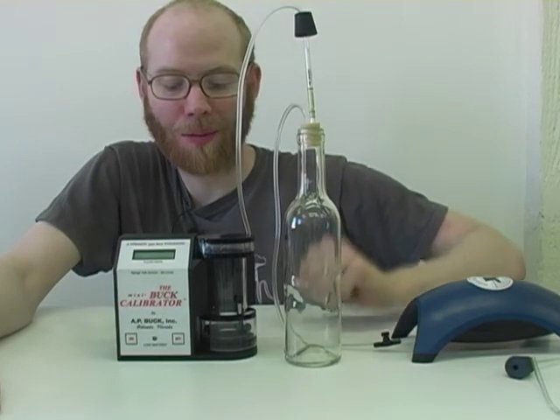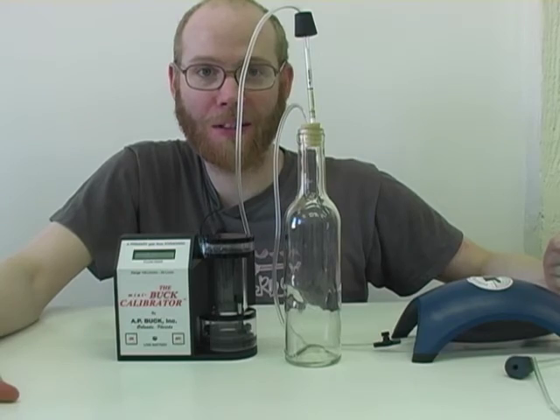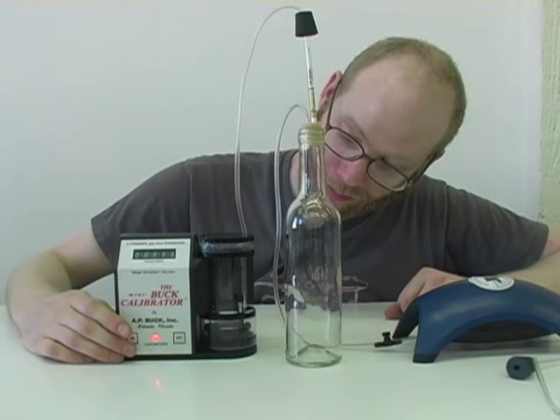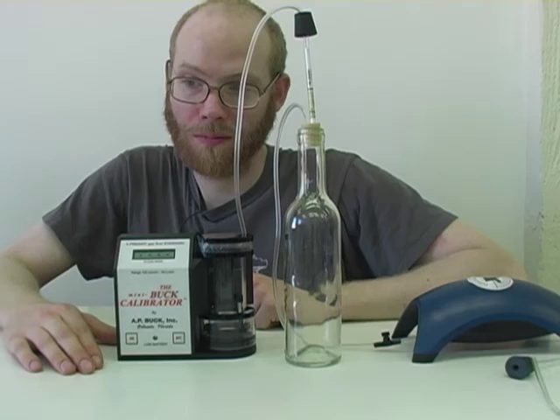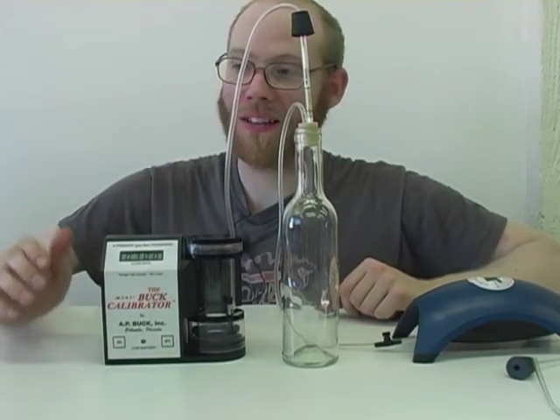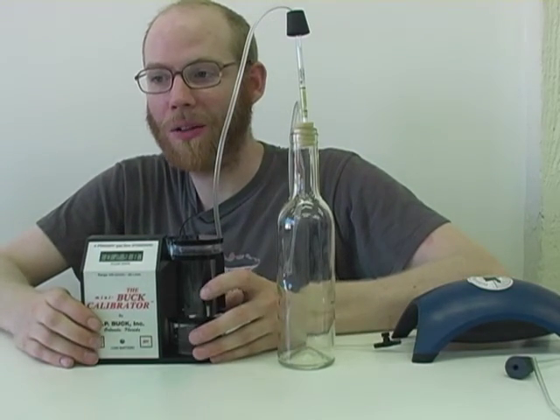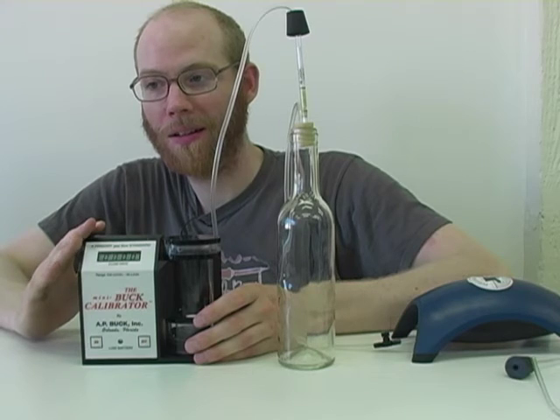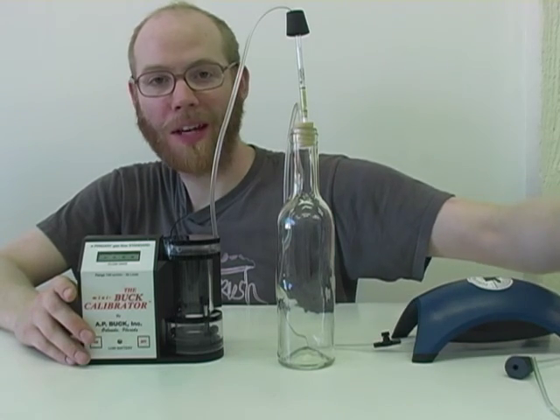I cleaned out the mini buck calibrator. I'll turn the pump on and take a measurement. The graduated cylinder measurement was 300 exactly. Let's do a couple more tests just to be sure. We have measurements of 298 and 300 milliliters per minute. The measurement with our mini buck calibrator corresponds with the measurements we made with our graduated cylinder almost exactly, which is great.